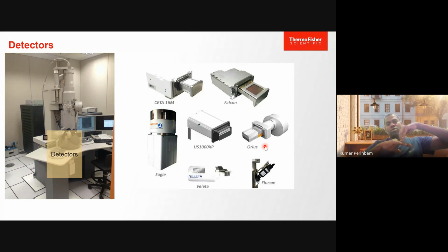When the electron beams hit the fluorescent screen, the electrical changes are observed by the camera, and these electrical impulses are Fourier transformed to get an image.